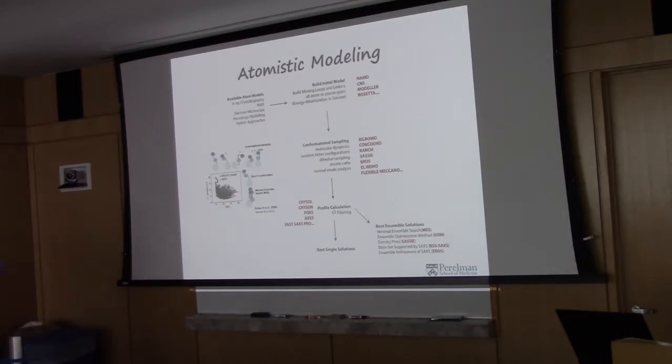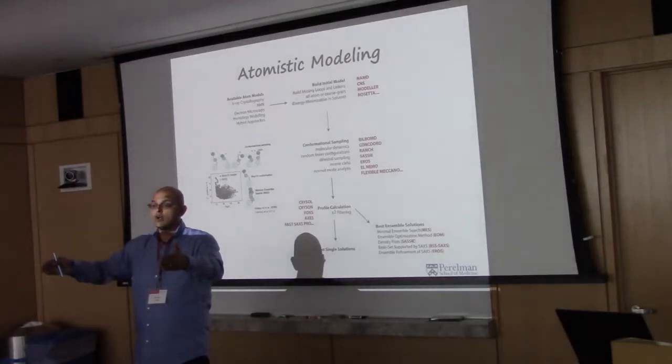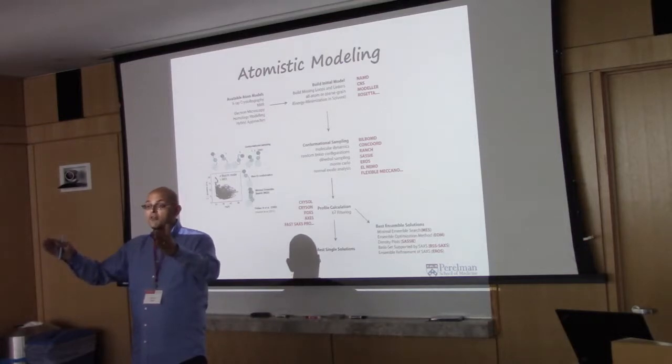So you computationally generate all of these models. This can be done with molecular dynamics, Monte Carlo approaches, a program called SASSIE that I tend to use a lot, along with many others. You can impose chemical common sense if you're using all atoms, so they have to obey a Ramachandran space, for example, or other force fields. Then you have that test set of structures. For each of those structures, you back-calculate and generate a theoretical profile. So now you have a big test set of calculated profiles.